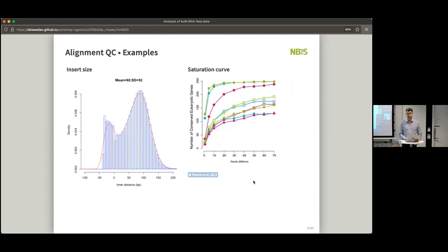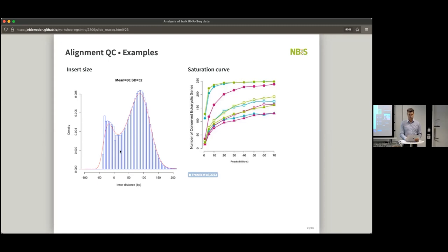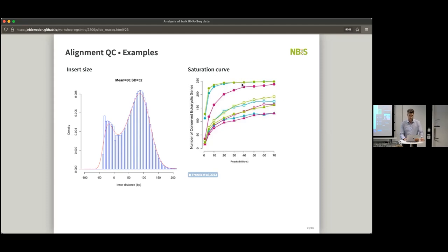Insert size is the distance between the two paired-end sequences — the inner distance, how many bases you have between your two reads if you do forward and reverse sequencing. Normally you would have a distribution here. In this case you see two peaks, which could mean there are some differences in the size distribution — almost looks like two groups of reads, some with a shorter insert and some with a longer one. You also have the saturation curve as another measure.